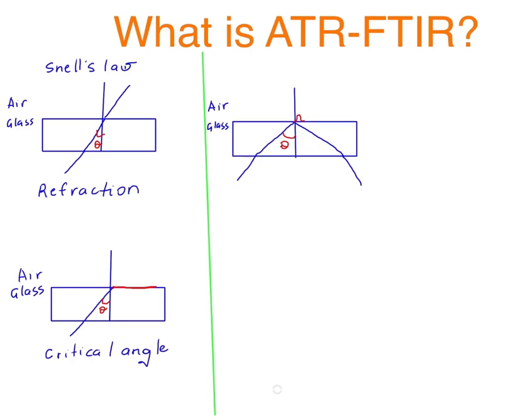They use that evanescent field to excite the molecule. This is called the evanescent wave, or evanescent field. That evanescent field is generated due to total internal reflection.